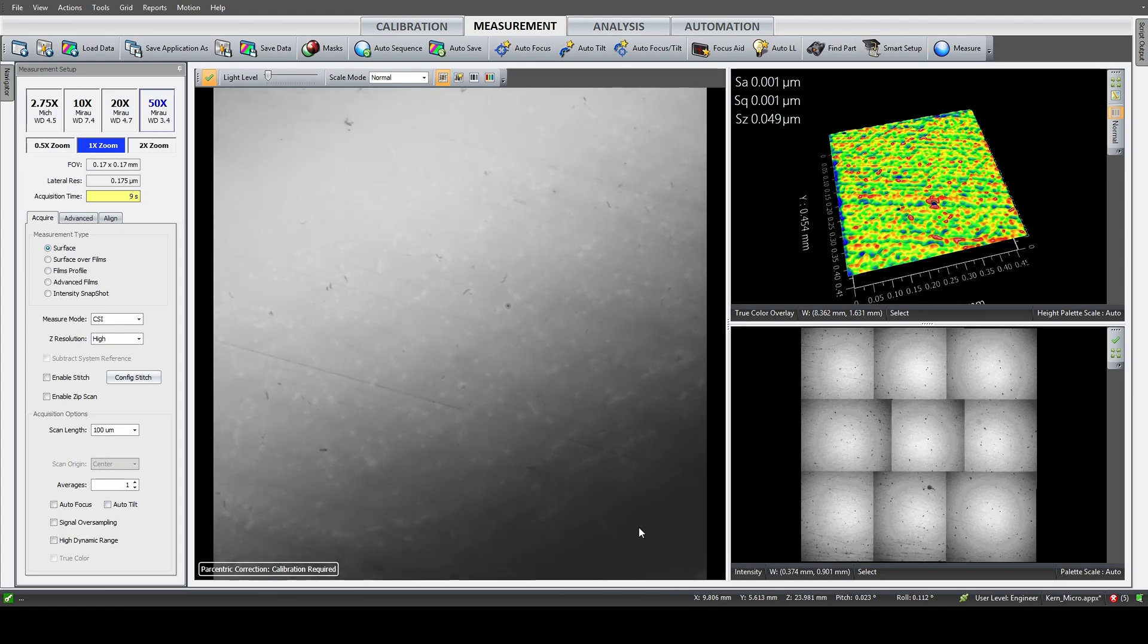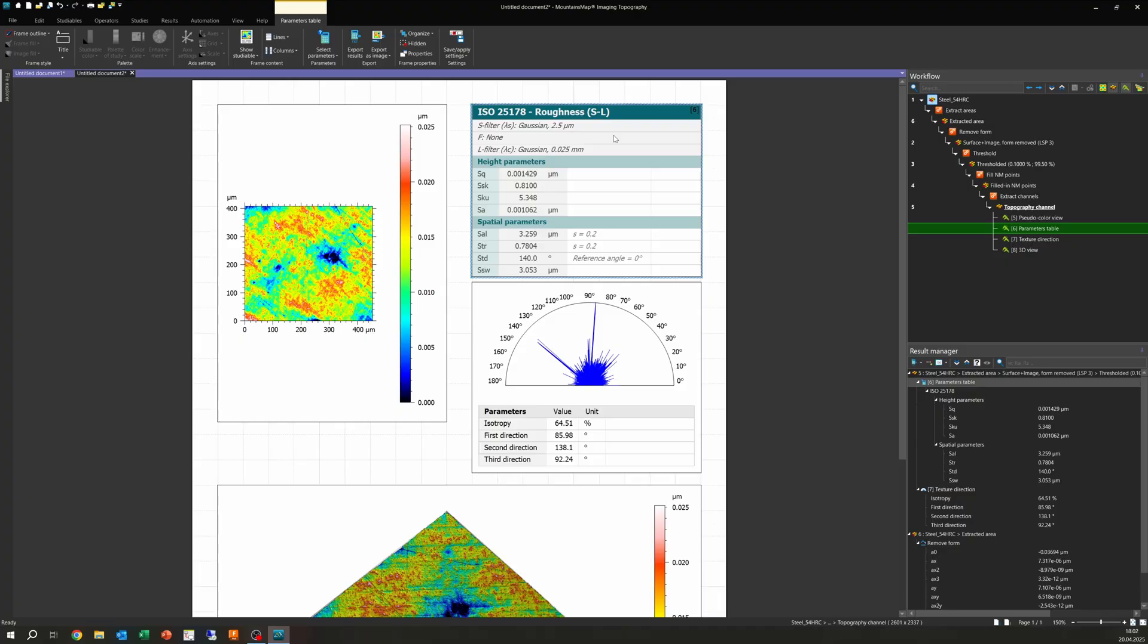The resulting surface roughness calculated in a similar way as before shows a very nice result. Surface roughness SA is about one nanometer, a more than respectable result considering this part was made on a milling machine and is hardened stainless steel at 54 HRC.